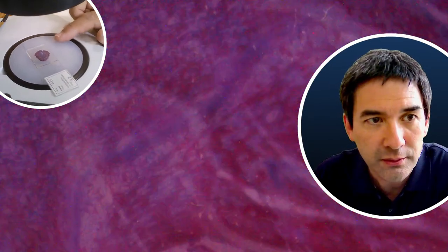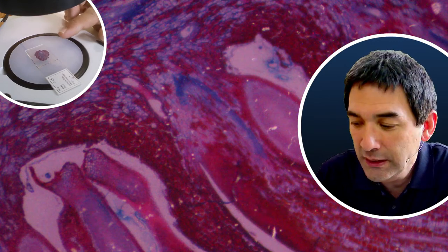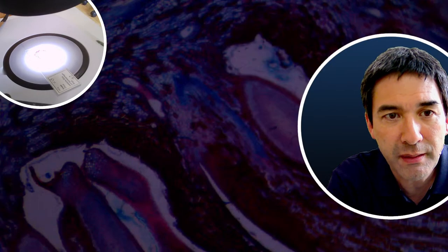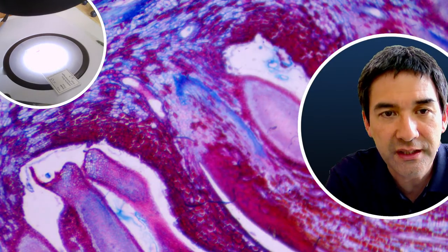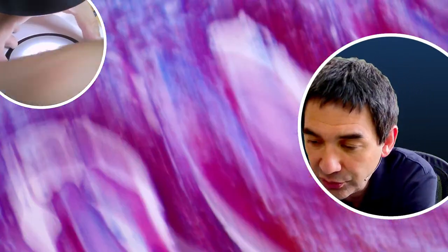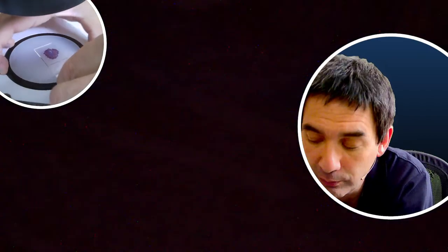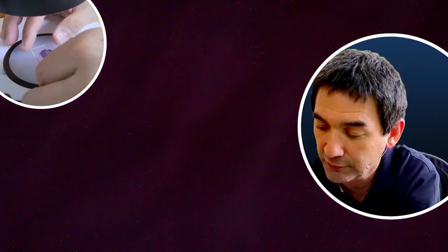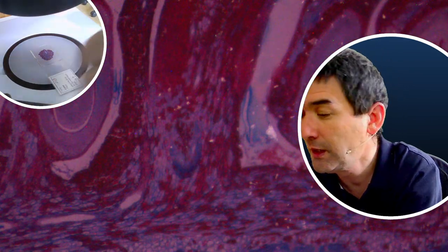There are different possibilities for lighting. You can see the camera is a little bit slow. First of all, you can have light from the bottom — there's an LED in here and a diffusing filter that goes on top. That is one possibility. Over here on the other side there are knobs you can turn. And when I turn the other knob, I'm able to get light from the top as well.